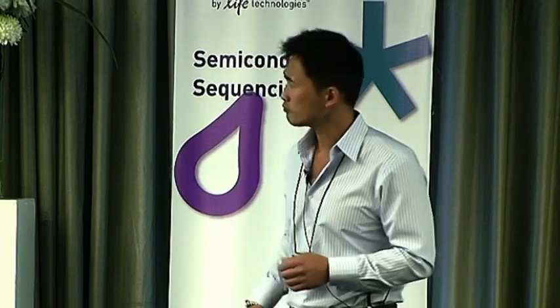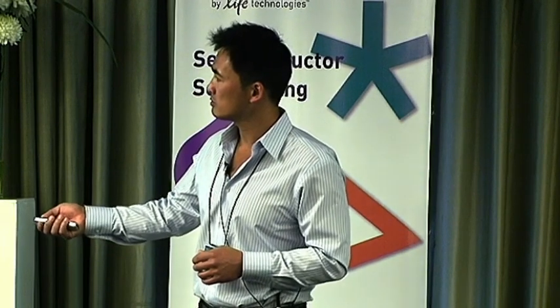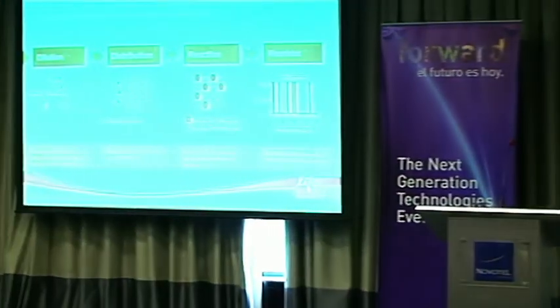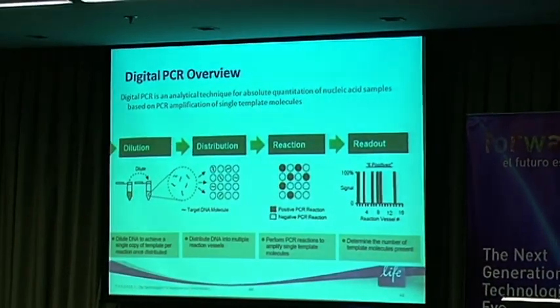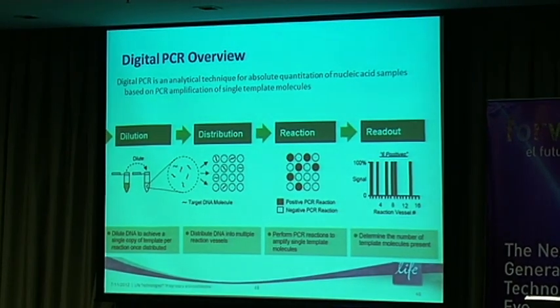The reason is that in order for digital PCR to be effective, you need a large number of replicates. What digital PCR basically is, is taking a sample, and this sample has your material, your cDNA or your genomic DNA. It has your master mix. It has the assay of whatever target you're trying to interrogate. It has everything pre-mixed in there.